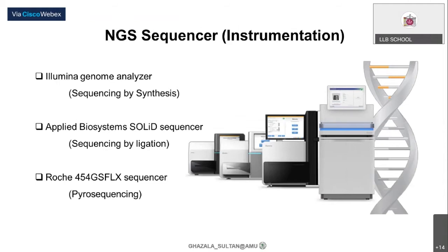Okay, sure. So this will be an overview of next generation sequencing, because we have a time constraint and we can only give the introduction section in an hour, as we know there is a wide spectrum of topics within NGS itself.